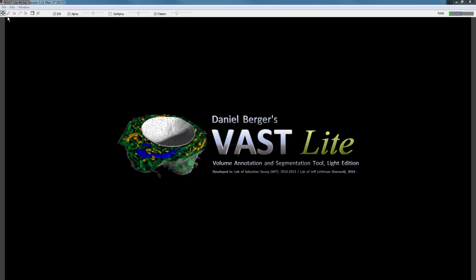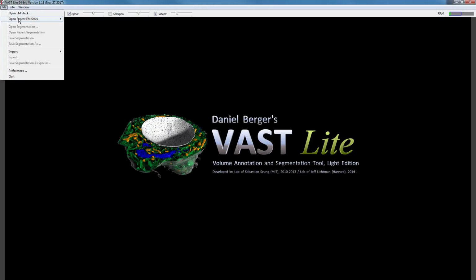To start off, I have loaded up Vast here, and we're going to load the same dataset that we used in the last video, and it's now listed under Open Recent EM Stack. So we just click this and we get the data fed back from Harvard onto the local computer.